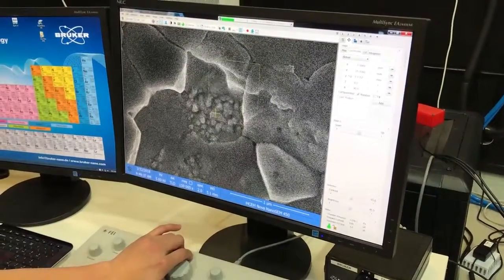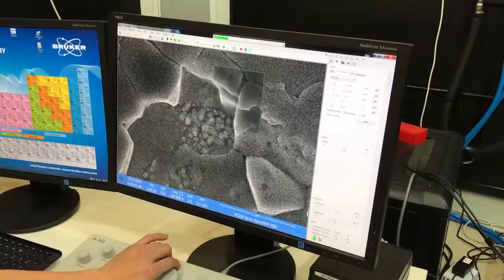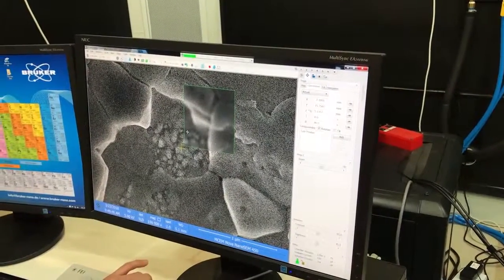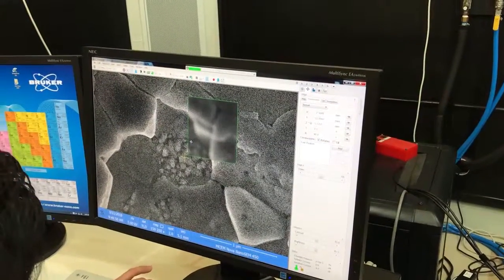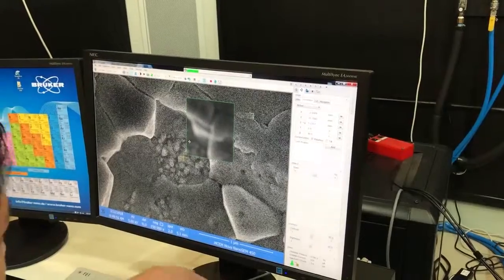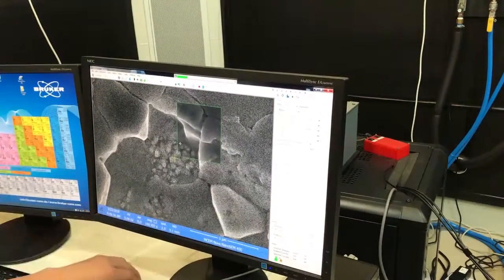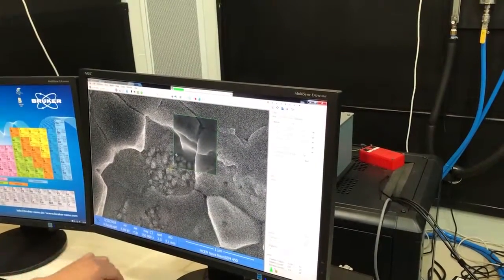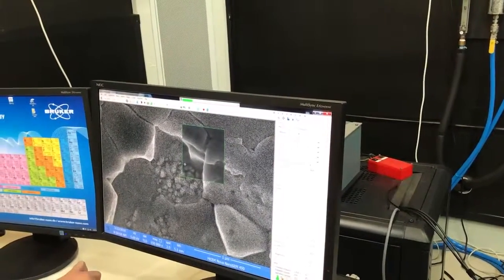Okay, so what I'm gonna do is correct for the astigmatism. So let's see if we have any astigmatism going on here. Okay, so folks, this is something I haven't told you in lectures. When you've got astigmatism, if you go through focus in one direction, the blur goes in a particular direction, and if you go through focus the other way, the blur switches into the other direction.